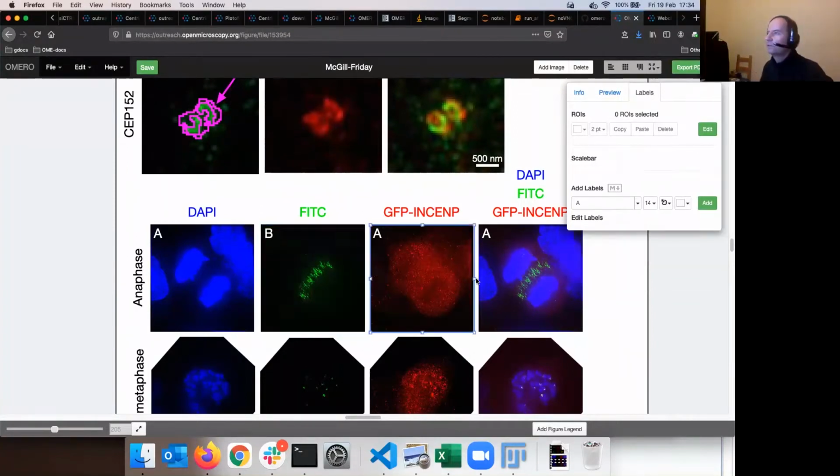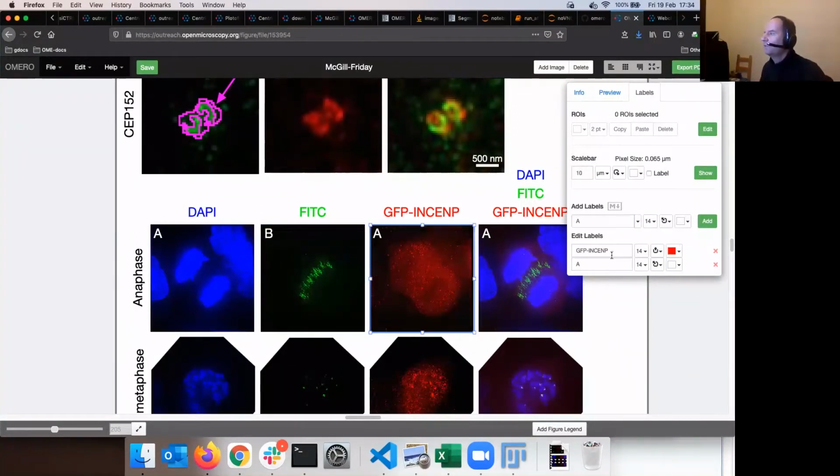Okay, so it changes to B. By the way, we had a question as I'm editing the labels here now. Yeah, you can see how I'm doing it. I'm in the labels tab and I'm rewriting the value of the label from A to C. The label doesn't change here yet. I have to either navigate to another cell, then it changes to C, or I have to hit enter.